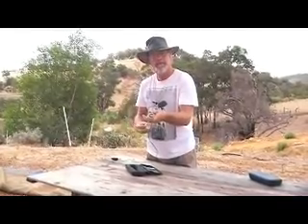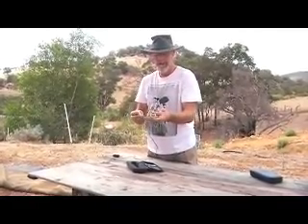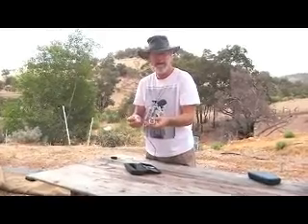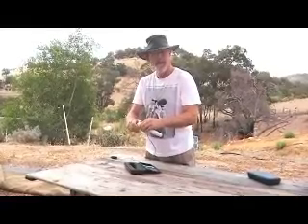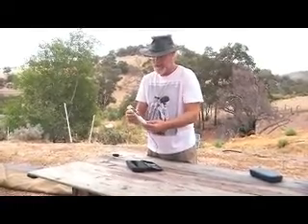There are four batteries on the top there that you can easily buy from any newsagent or pharmacy. But if you forget to turn it off, it will turn itself off within a minute or so of you using it.